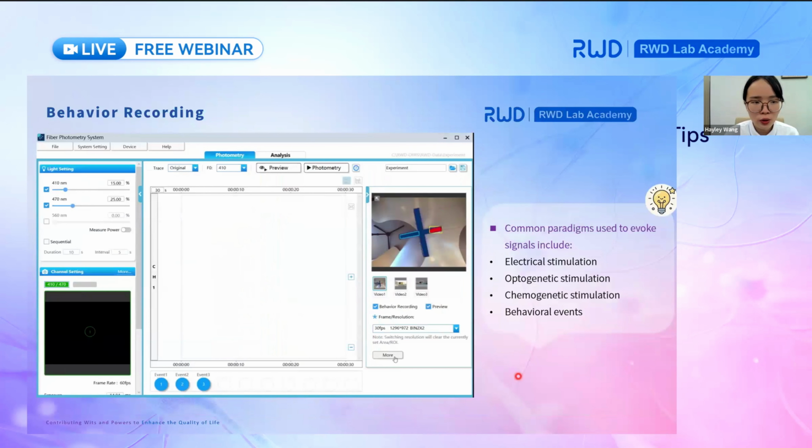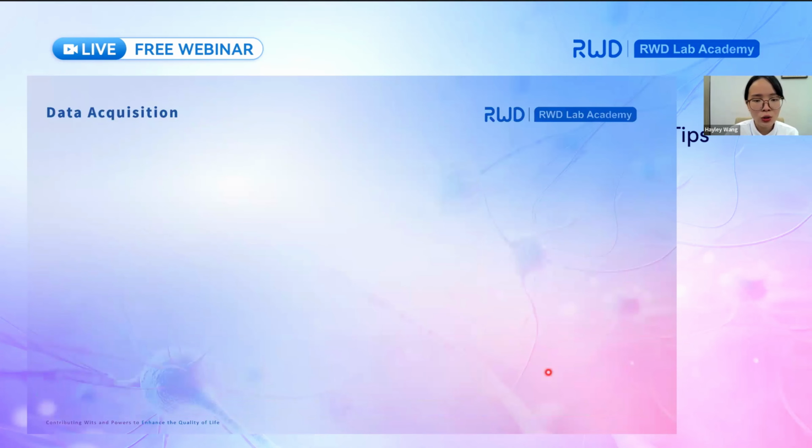Okay. All the parameters have already been set, so we can now start recording. Next, I will use our software to give a demonstration. This is a video that we recorded in the morning.